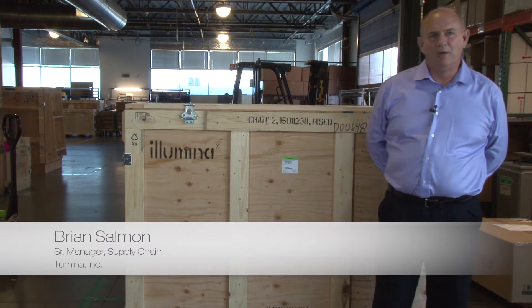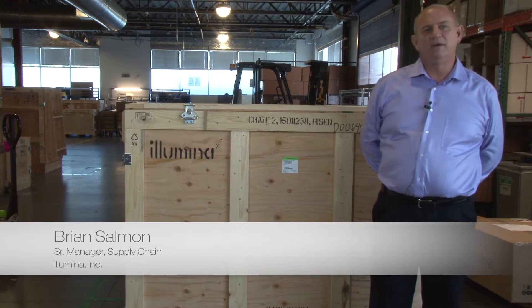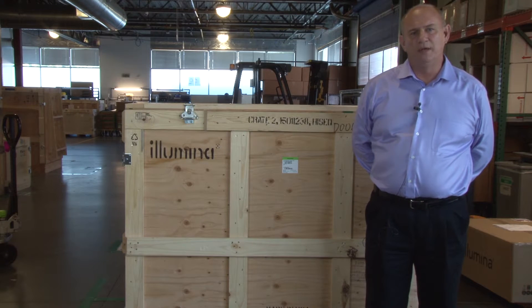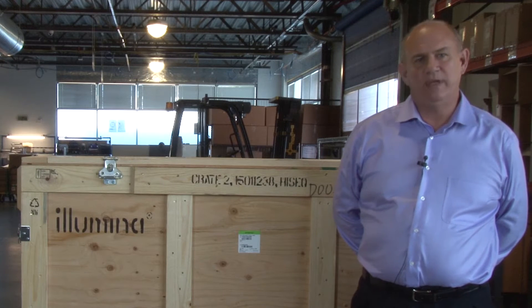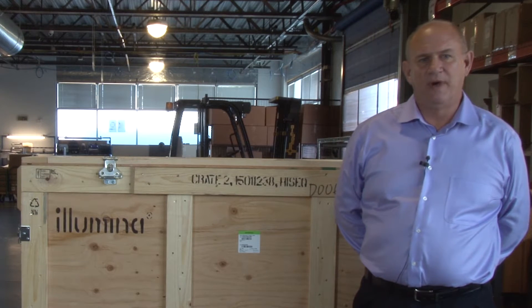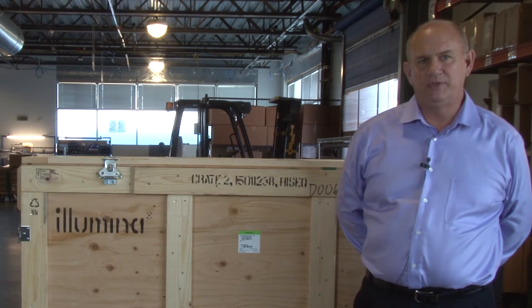Hello, I'm Brian Solomon, Senior Manager of Supply Chain at Illumina. We have created this video to demonstrate the proper way to uncrate and recrate the HiSeq instrument. Improper uncrating can damage the instrument, customer property, or cause injury to the handler, so it is critical to follow the steps illustrated in this video at the customer delivery sites.